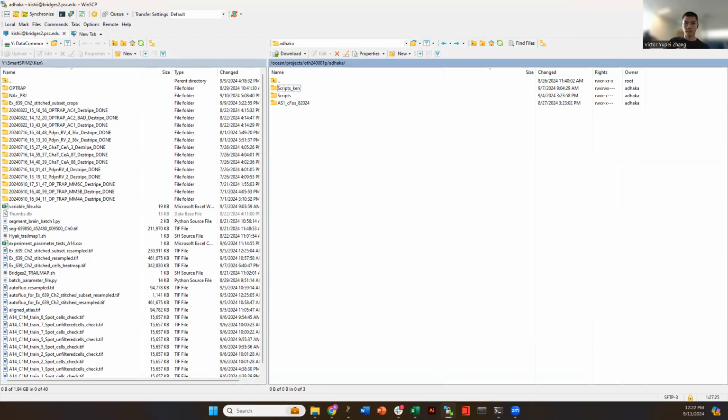Okay. Sorry, another quick question. I will be generating a whole other set of around 23, 25 brains actually. I'll do a whole separate iDISCO and a whole separate staining. But there's going to be variance between the two clearing and staining protocols. Would you recommend that when it comes time to do that, I regenerate a whole new classifier for all? That's actually a great question.